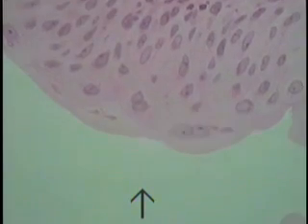If one courses along looking at this scalloped interior and these large balloon type cells extending to the surface, oftentimes one will encounter cells that are binucleate. That is, an individual cell will contain two nuclei. This is typical transitional epithelium seen at increased magnification, showing these large dome-shaped cells.